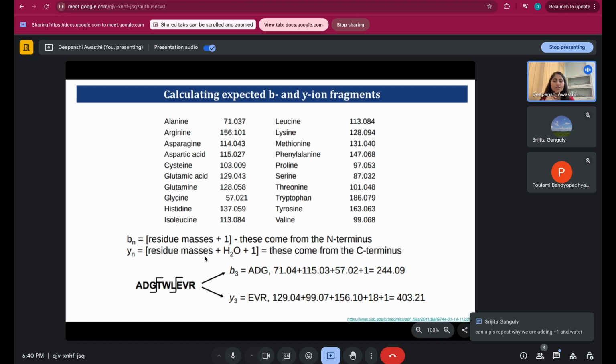Okay, so why are we adding this? Because whenever we are doing ionization, some bonds are being broken and certain ions are present, because there is something else in the environment during ionization. For example, previously we have seen that there are different fragmentation methods. In some methods you are passing them through inert gas, or throwing some light, I'll show you.